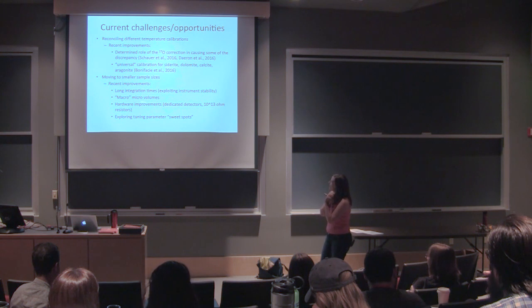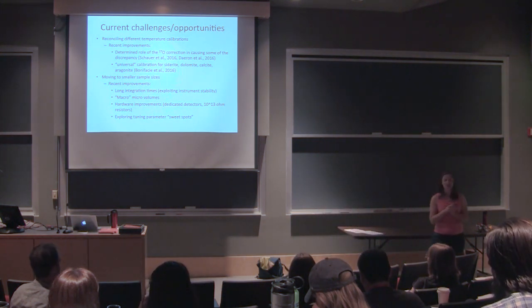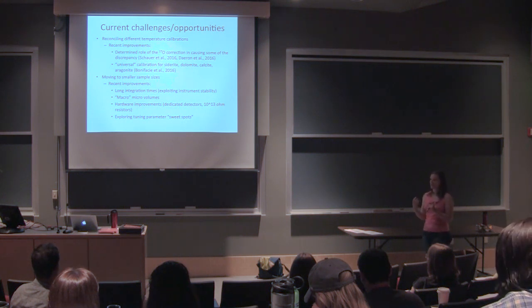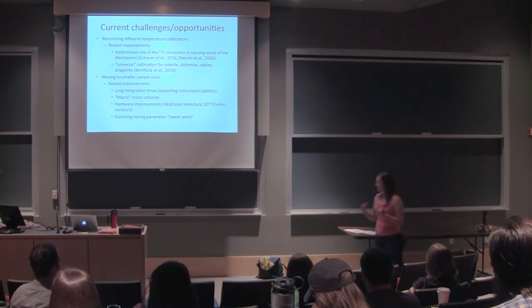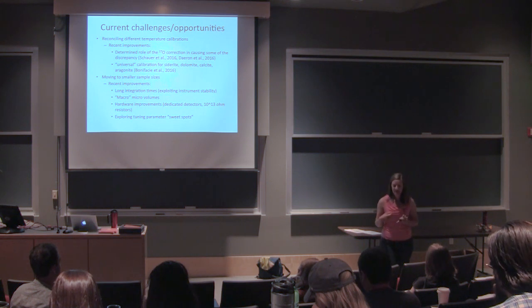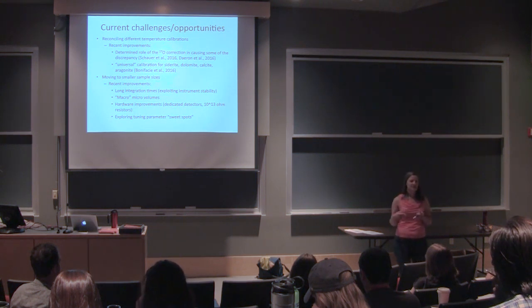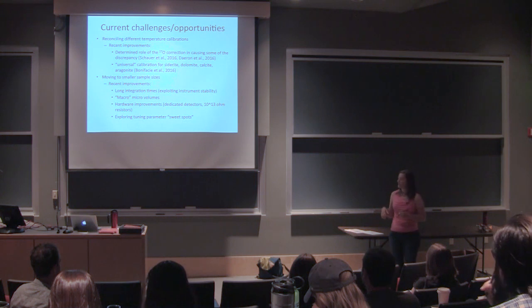There are enough people now wanting to make this measurement and other mass spec companies that have gotten involved that we're starting to benefit from actual good old capitalistic competition. So as Thermo was kind of the first company to make a machine that could measure this, as other mass spec companies wanted to get in the game, people started adjusting and introducing new innovations from the hardware side that may help with some of this.